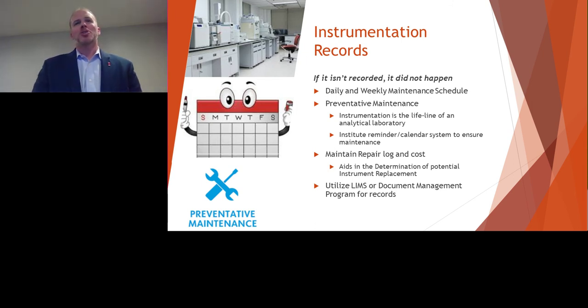Even if your chemists swear up and down that, yes, I do this religiously every other day, they need to be recording it, because it's important that we do our daily and weekly maintenances, and then also our larger preventative maintenance schedules to keep the instruments running the way they're supposed to be running. And then also that can reduce your cost of instrument repairs in the long term.